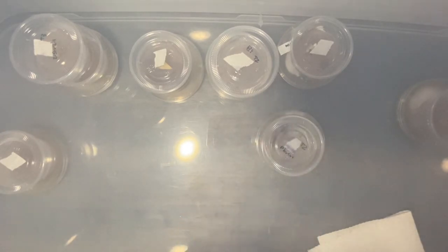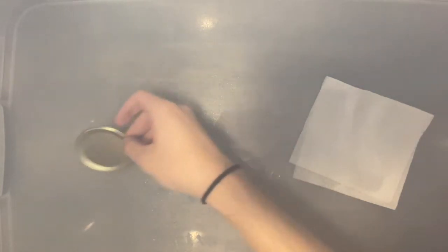Okay, now I'm gonna tape all those petri dishes back up, throw them in the drawer, and I'll get back to you guys whenever I have the liquid culture set up. All right, I have everything put away from the agar to agar transfers, and now it's time to do multi-spore syringe to agar and liquid culture.